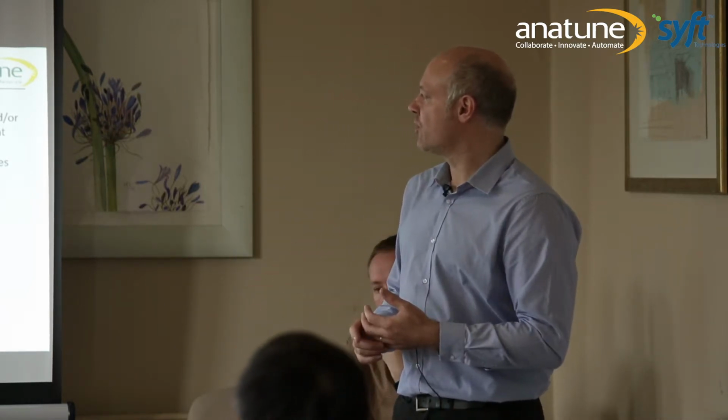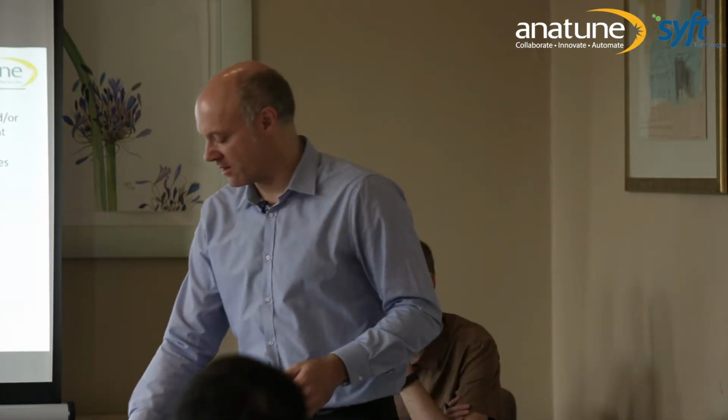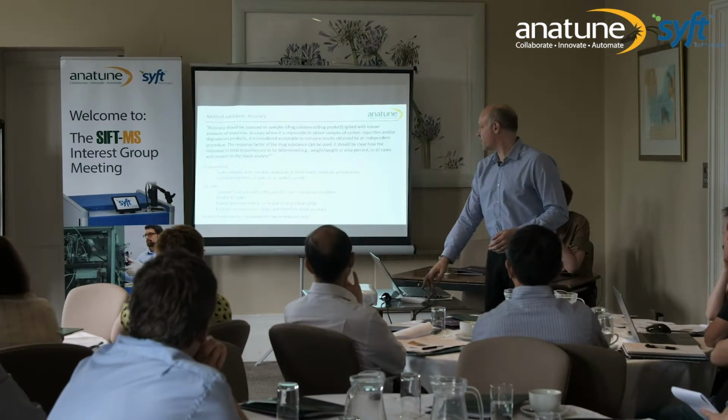So you can't actually do this spiked recovery exercise with a gas phase sample unless you can absolutely fix the volume of gas you're spiking into. And in this case, because they were manufactured products, you can't do it. So the approach taken here was not to spike in and recover at known concentrations, but to repeat the precision test at 10 and 90%. So we're showing accuracy at the back ends of the expected range of the method.